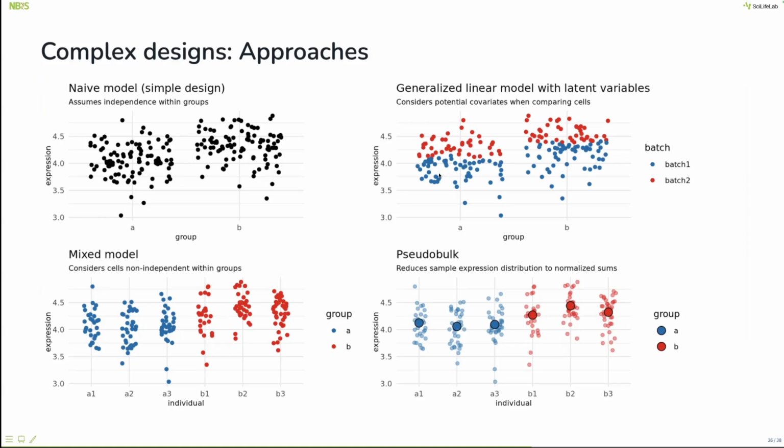And then when you have your differential expression, you can also go back into the single cell resolution and check what the distribution looks like, once you have your differentially significant genes. Basically, you could use this to have a more certain repertoire of genes that are differentially expressed, and then go back to single cell level and see what is happening.